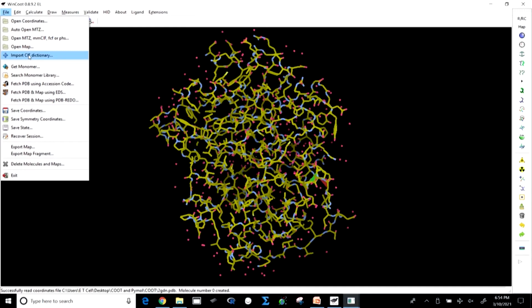If you remember in the previous class when we were discussing the PDB file, I showed you the difference between atoms and heteroatoms. The atoms are made of all those standard amino acids, nucleic acids, lipid, carbohydrate, water and all. Heteroatoms are what you are developing, a new drug or something.